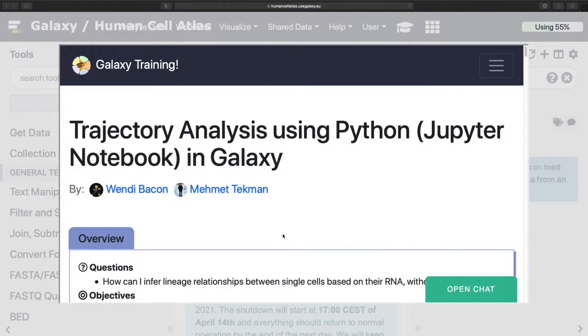I will be doing this tutorial in the Human Cell Atlas, well to start with, HumanCellAtlas.UseGalaxy.eu, purely because that's my favorite one, because it's the first one I ever used.